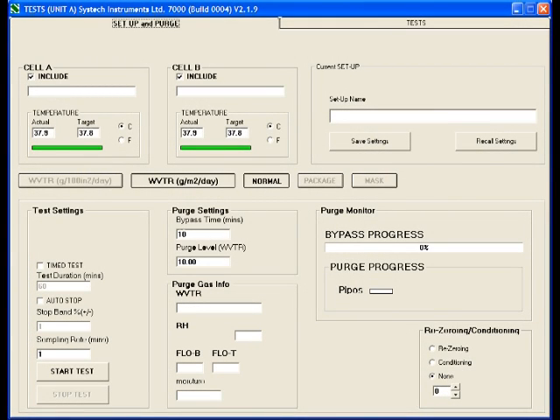Very simple to use. Here you can see the setup screen where you enter the required parameters, such as temperature and relative humidity.